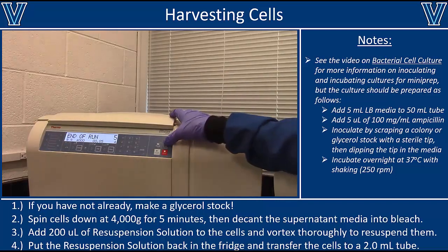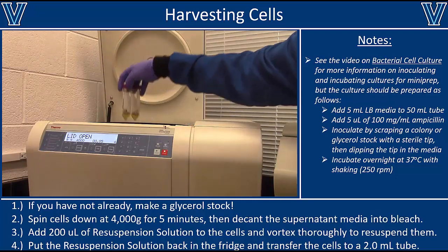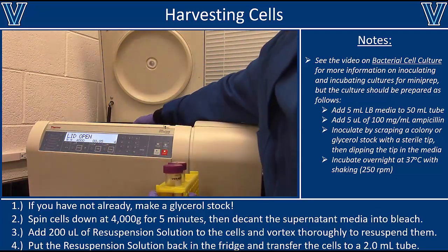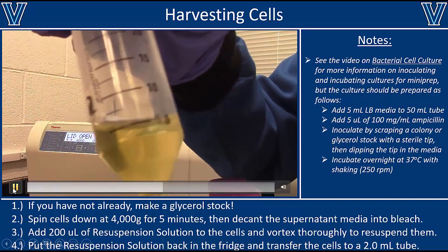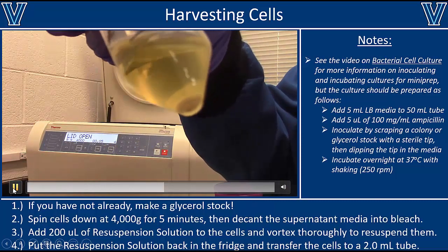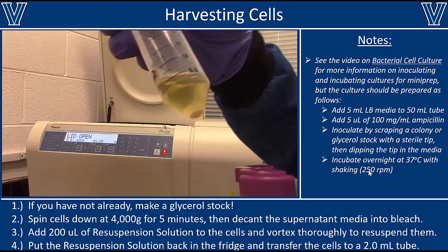All right, but after that is run, this is what the tube should look like. So be very careful to remove them gently. You don't want to resuspend your pellet here. But this is what a good cell pellet would look like. Something like this, where you see a nice tight pellet at the bottom and the media above it is absolutely clear. If the media is cloudy at all, you'll want to repeat the centrifugation step to make sure you get as many of these cells as possible, because the more cells you pull out of the solution, the more plasmid you'll get at the end.